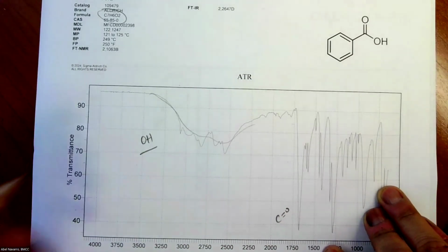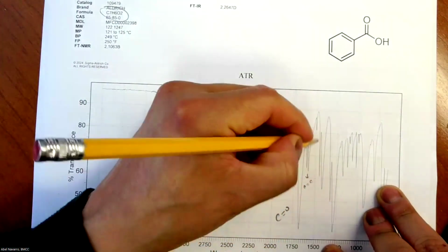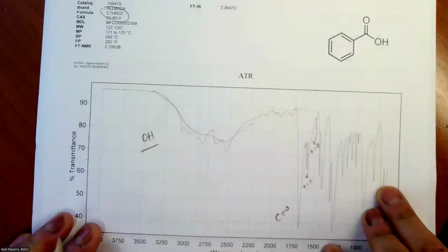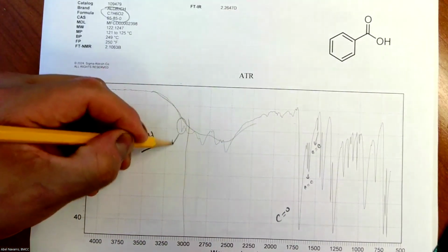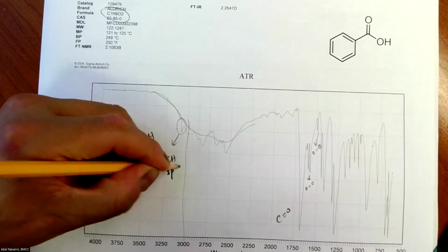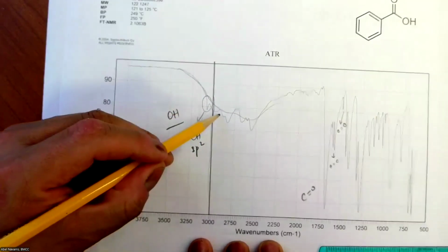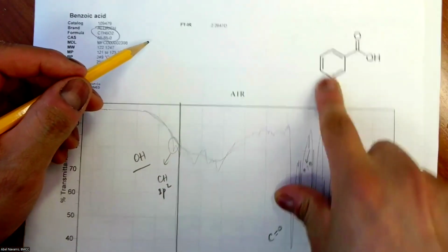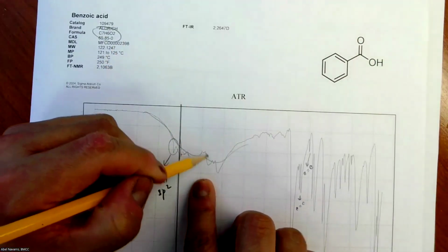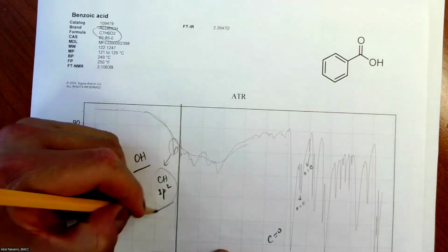Okay. Where are the aromatics? Yeah, the aromatics should be here. This one should be the aromatic C=C, and this one should be the other C=C. CH sp2, I can't see it. It's here maybe. CH sp2, maybe that one, right? Because this one is my 3000 line. That should be the CH sp2. Here should be CH sp3, but do we have CH sp3? Actually, we don't have CH sp3, so we should not see it. You just get distortion. Those lines are just distortion. But if you do your best, you could say this one is your CH sp2.